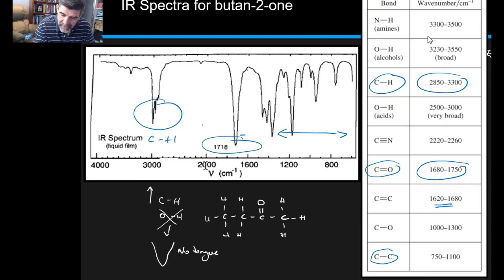But what about the carbon-oxygen bonds between 1000 and 1300? It's sort of hard to detect what's going on here.